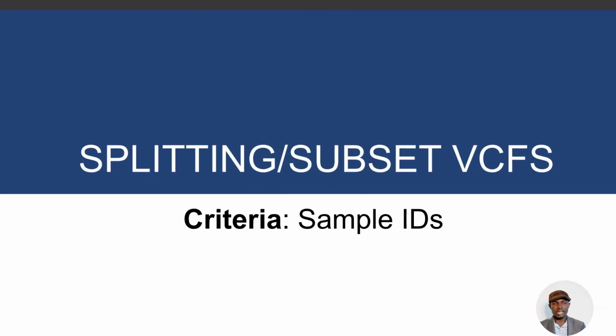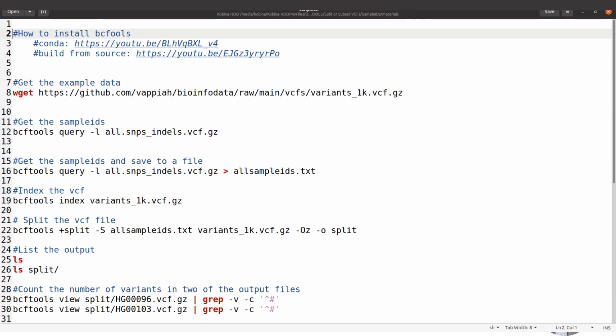In today's tutorial, I am going to show you how to split or subset VCFs, and the criteria we are going to use is sample IDs. So let's get started.